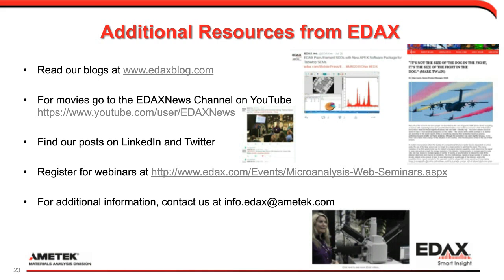If you look at something like iron, the iron K alpha sum will be out around 13 keV, which is much further out, and the efficiency of the detector essentially drops off when you're out there. So it's further out in the spectrum. It's not as efficiently detected, and that's one of the reasons it seems more severe.